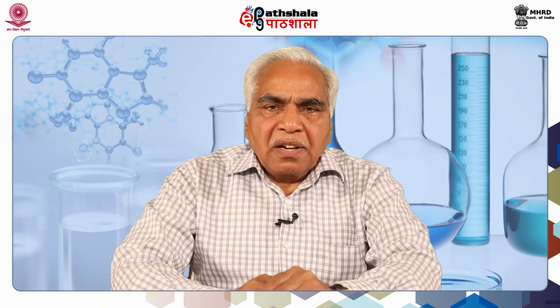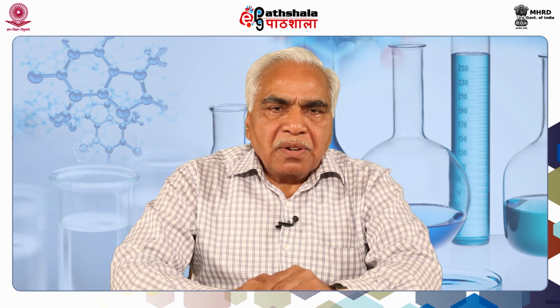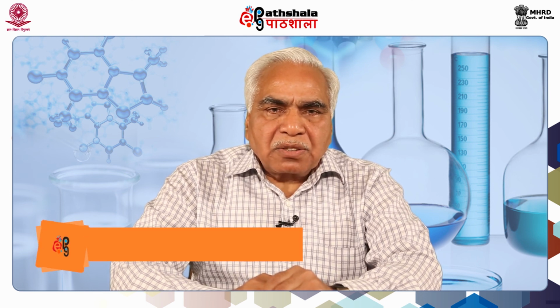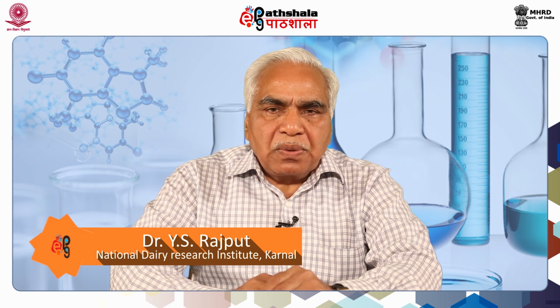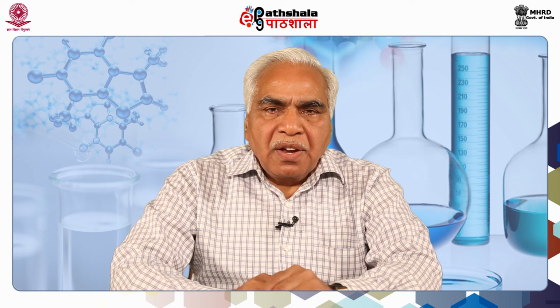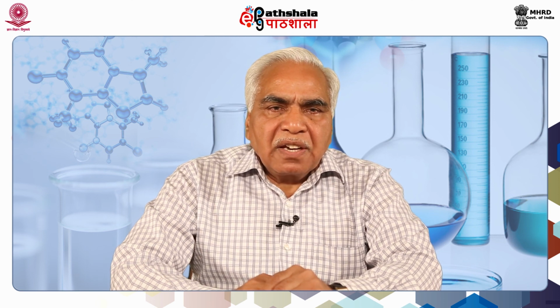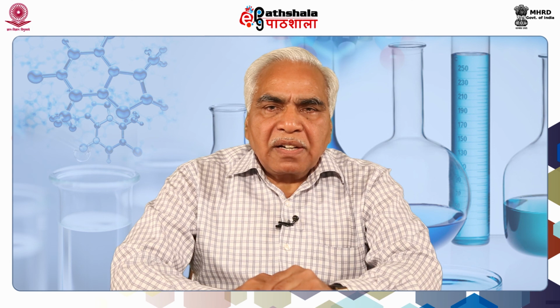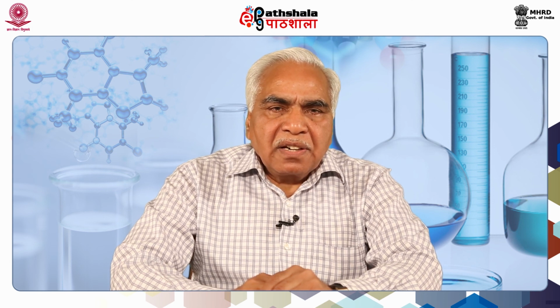Dear students, let us now summarize what we have discussed. Scanning electron microscope is a powerful tool in the hands of researchers for range of applications in the field of life science. The technique can very well be utilized for elemental analysis.